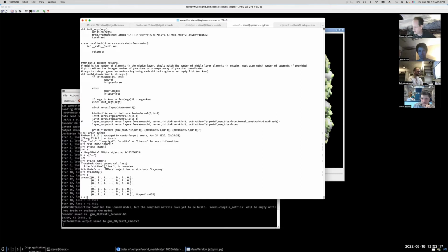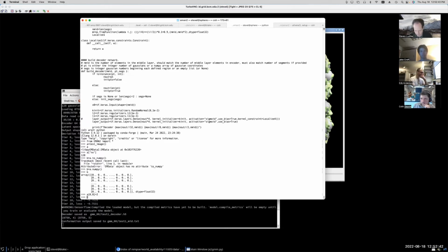So it's actually very nice if you want to do stuff with NumPy and SciPy, and you also want to do stuff with EMAN2 functions, you can freely move back and forth between them, with one caveat, which is if you modify the EM data object, that will immediately show up in the NumPy object. So if I say A of 0, 0 is equal to 2, right? So I modify the EM data object. 0, 0.